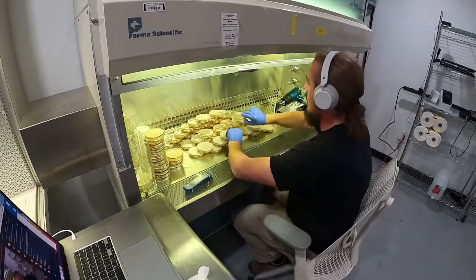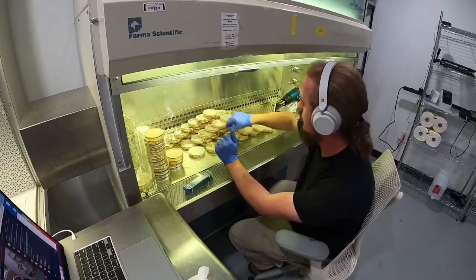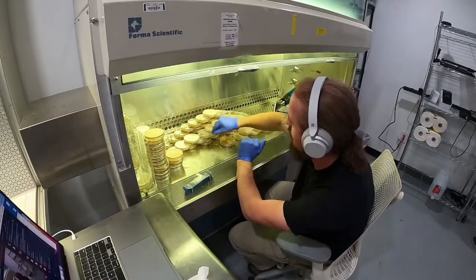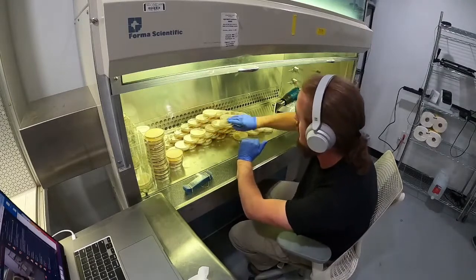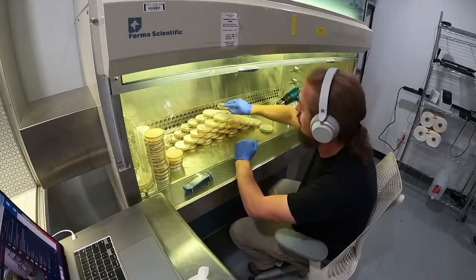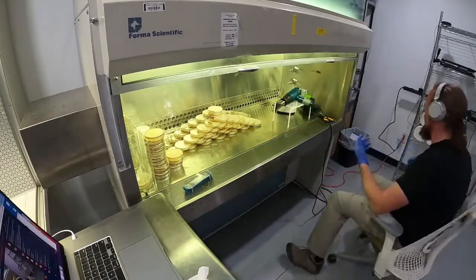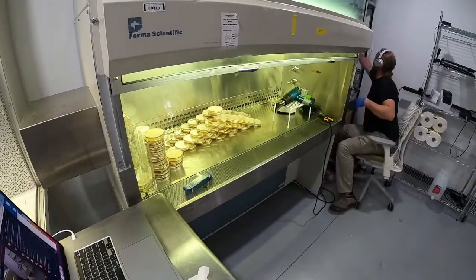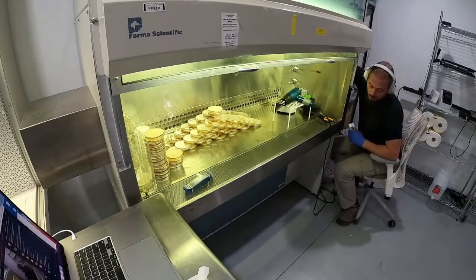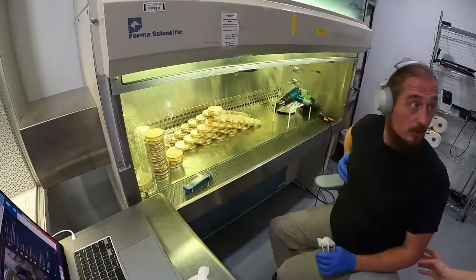So, as I was saying, spores are inert, right? Spores are immune to radiation for the most part. They're immune to cosmic rays. They're immune to random acts of violence. They're immune to all sorts of things, right? And so this is why there's a group of us who probably think that the first organic life really was kicked off by fungi from space. So that's all cool, though. But the moral of the story is that spores are inert, right? So you can't count on them to give you a viable biological load.